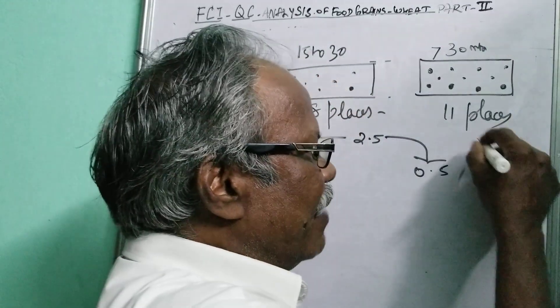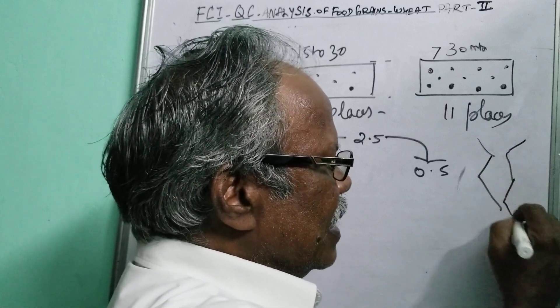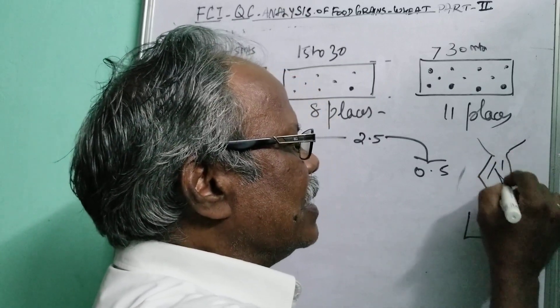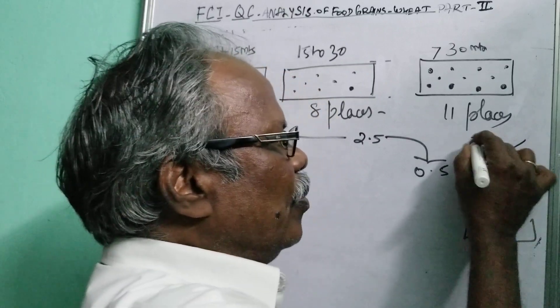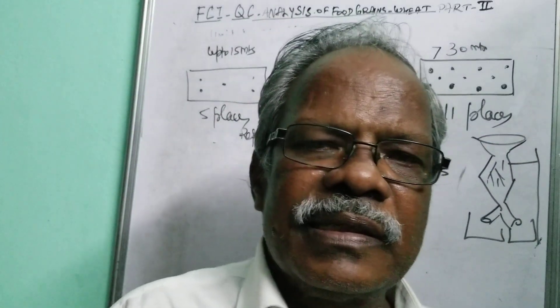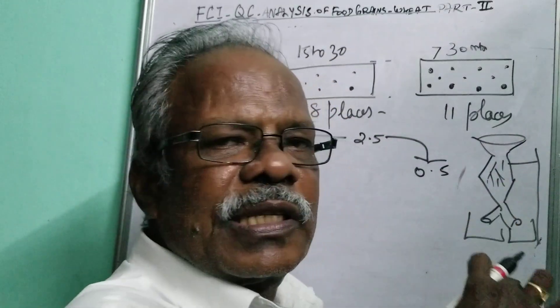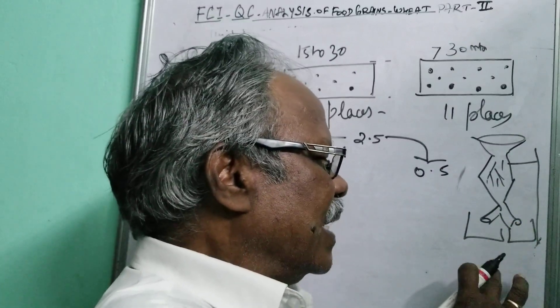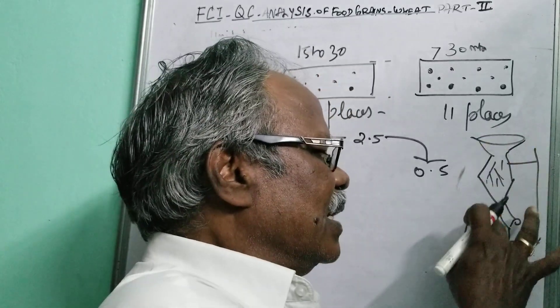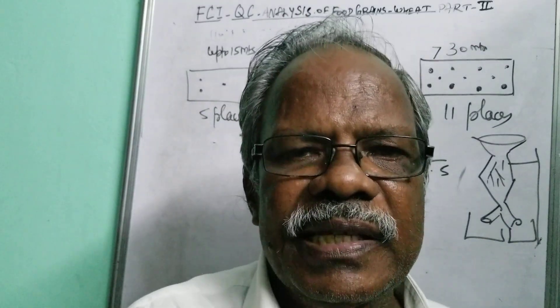The sample divider has a conical shape with two spouts and pans underneath. Slots inside it equally divide the sample — the wheat falls through the slots and into the pans. One pan is retained and the other is removed. If the sample is 5 kg, after one pass it becomes 2.5 kg, then 1.25 kg, and so on, until it is reduced to 0.5 kg.